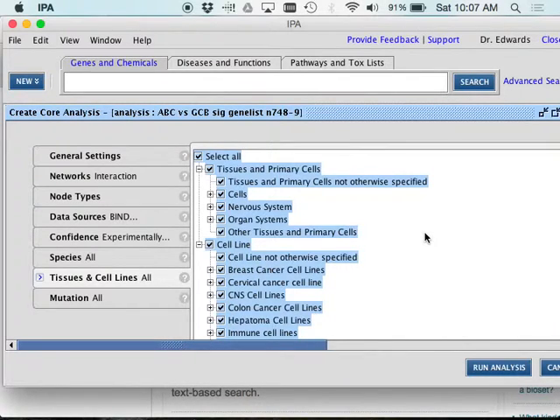Stromal cells. What else? Immune cells. It's a garbage can. You've got epithelial, all these different cell types. What if you're only concerned with, say, the activated TH cells? I can tell this software to filter that mess and show me only those genes known to be expressed in T cells. And it'll do that. This is a very good thing to use.